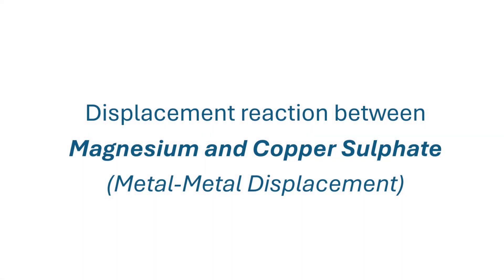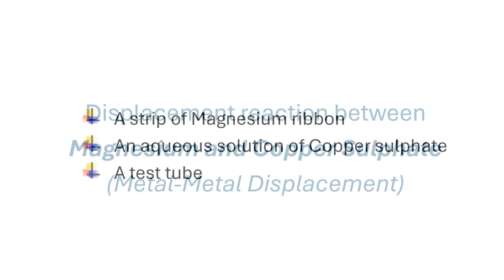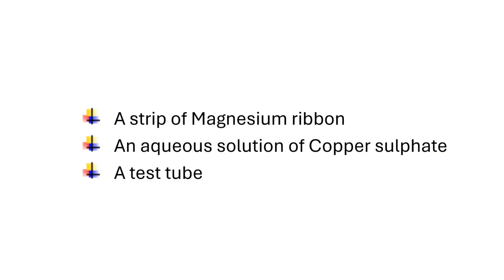Yet another common example of a metal-metal displacement reaction is the displacement of copper from its solution by magnesium metal. To perform this experiment you'll need the following: a strip of magnesium metal, an aqueous solution of copper sulfate, and a test tube.